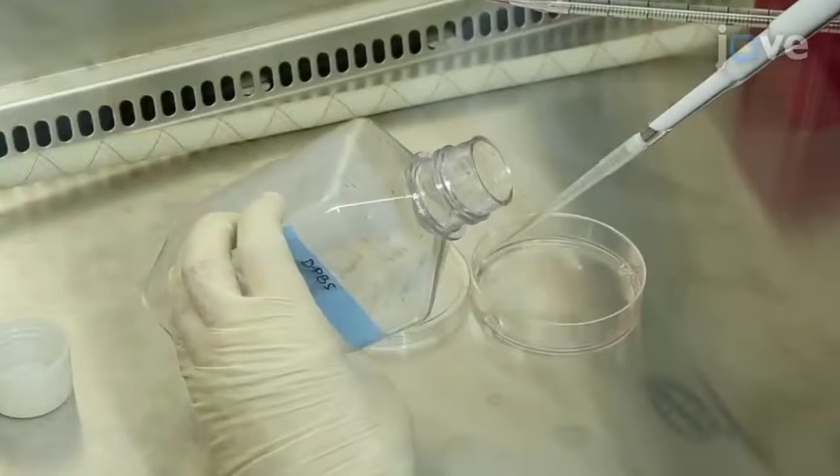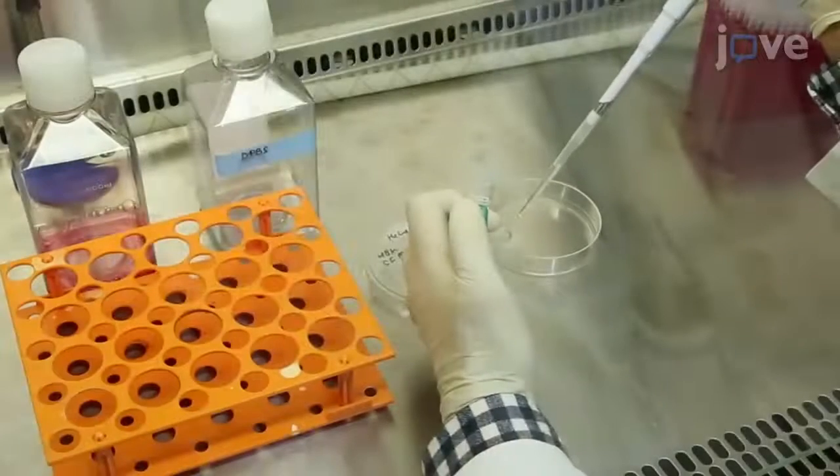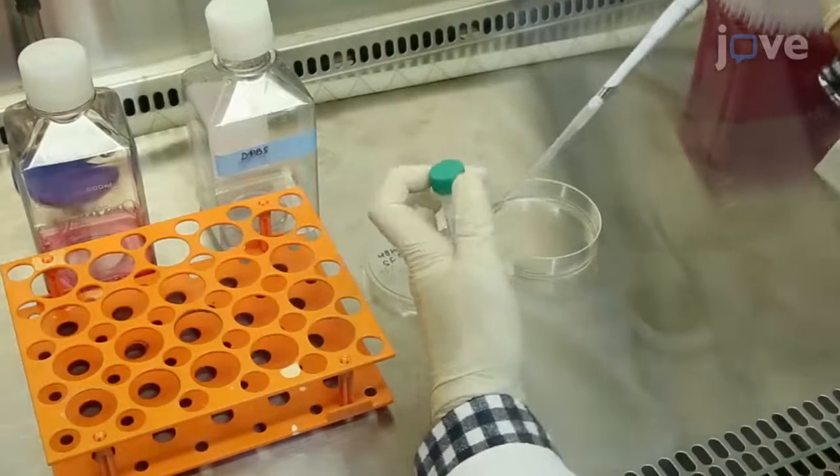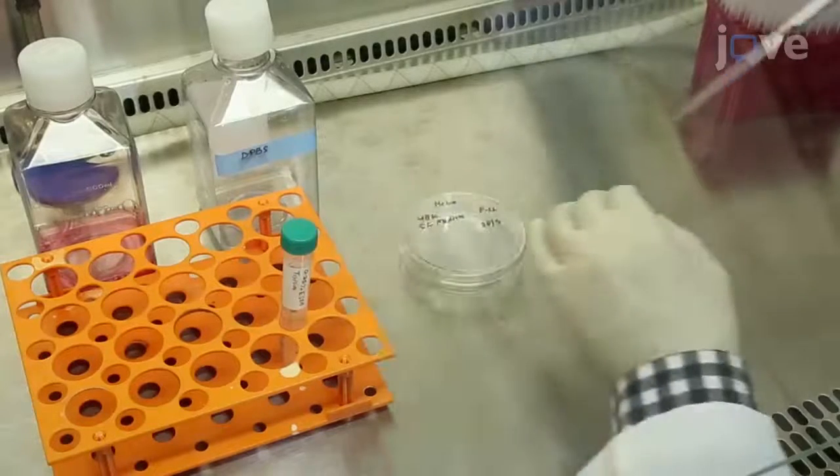After 48 hours, wash the cells with 2 mL of PBS, followed by incubation in 2 mL of 0.25% EDTA plus trypsin for 2 to 3 minutes at 37 degrees Celsius and 5% carbon dioxide.